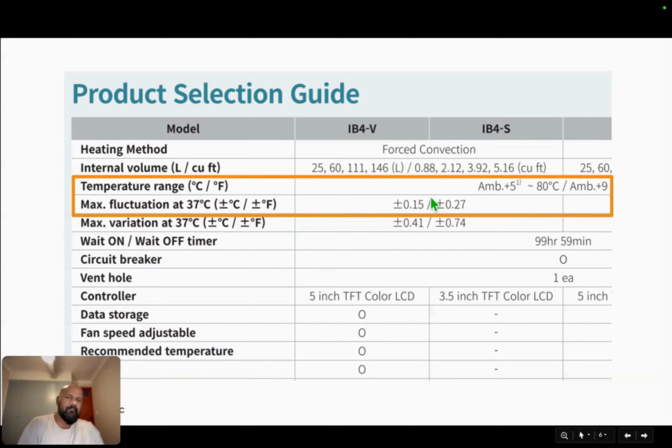If we are speaking to a customer, especially customers with a very high need for temperature stability or with temperature sensitive samples, not every customer's need for temperature stability is this high, but especially when you deal with pharma, it's important to understand what sort of range they need and to see whether our equipment can meet the range.